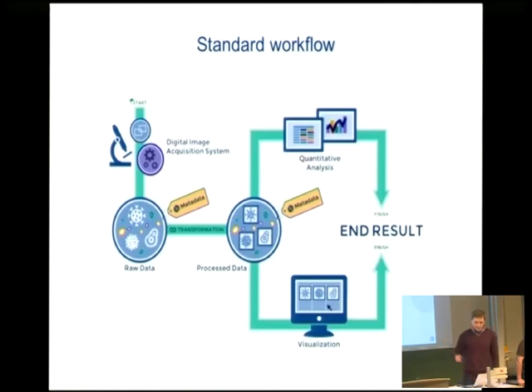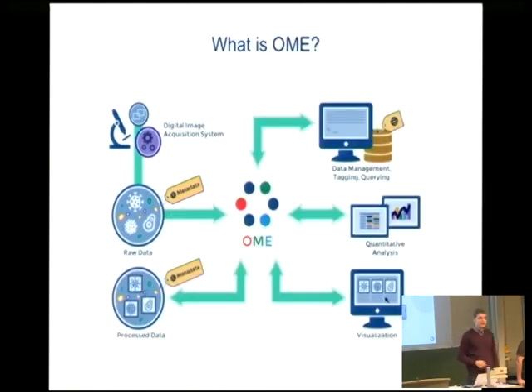So, seeing the workflow, one might ask how does OME fit in? The consortium that we both represent, OME, tries to be this broker, this glue that sits in between the image acquisition system, the users, the presentation and storage elements. We don't solve all problems for the scientists, but we try to solve the ones that are the most common. And we also, under the OME umbrella, facilitate cooperation between commercial partners, us developers, and open source projects that build on top of our API.